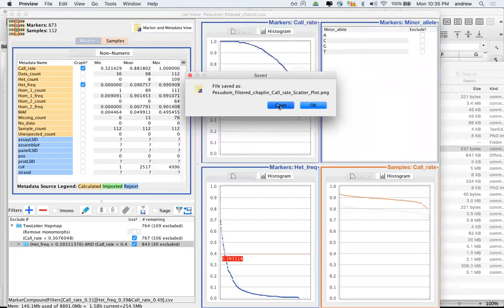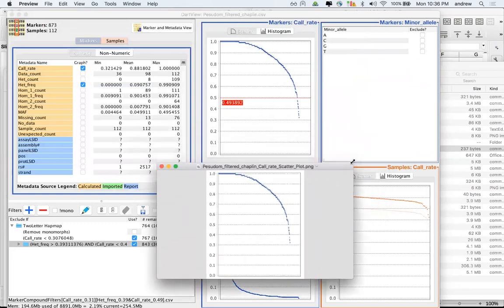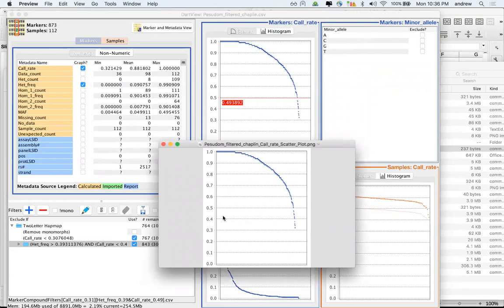Nothing is shown for the x and y axes. It would help if it told us what the x and y rows are. So we have some values for y, but they are missing for x, I assume that's what you're referring to. Then we would know what these values are, and it would really help us.